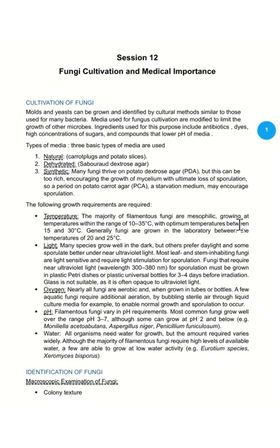The third type is the synthetic media, which is prepared by certain companies and is found ready-made in petri dishes. This type is the potato dextrose agar. This is a very rich medium in nutritive value, and the fungi tend to produce mycelium very fast on this media, and they lose sporulation, the spores, because they have all the available nutrients in the media.